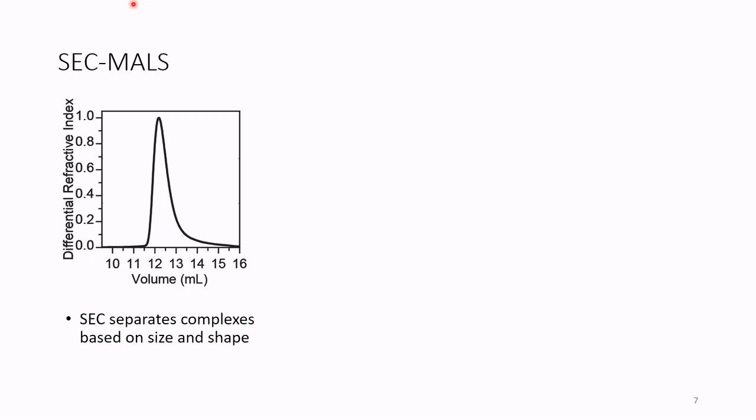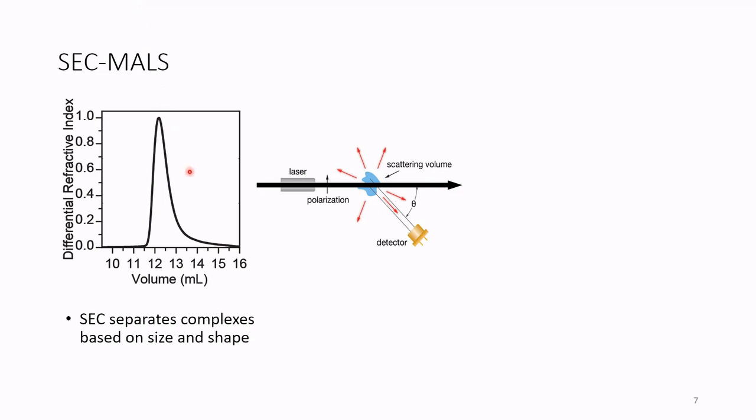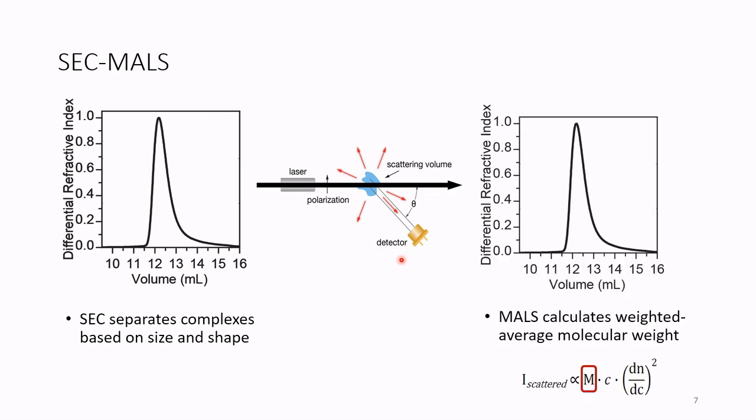Once our proteins move through the chromatography system, it enters into the light scattering system. Here, in the laser cell, a laser hits our samples as it passes through, and light is scattered in all directions. We have detectors in 3 different directions, which is in the miniDAWN TREOS, and that will measure the molecular weight.